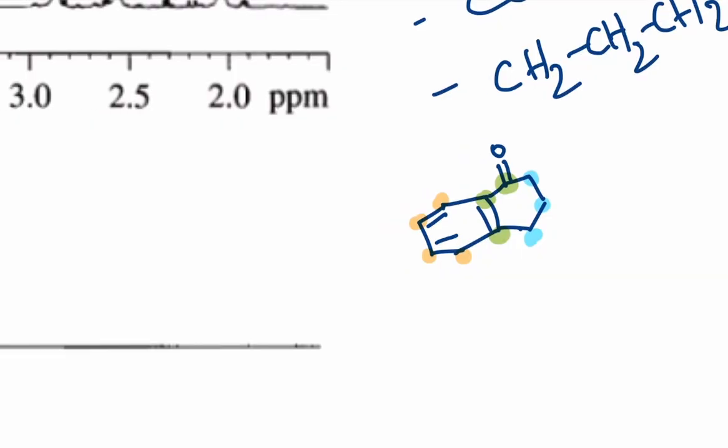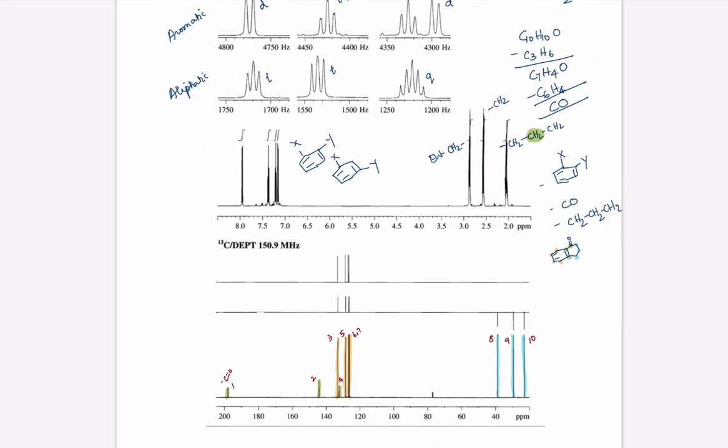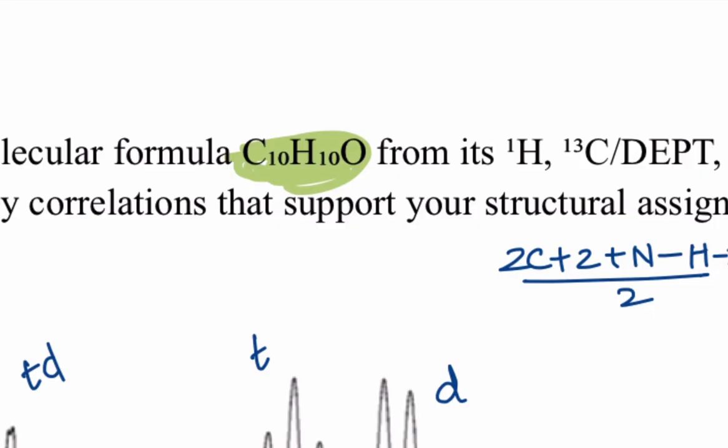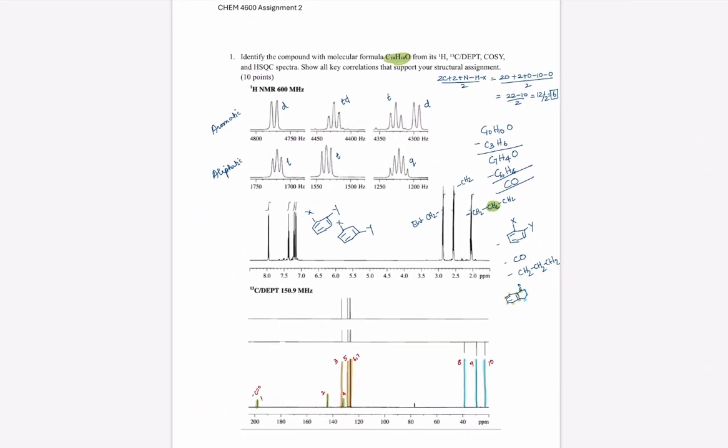Okay, now what we are going to do here is number the carbon peaks going from downfield to upfield. So 1, 2, 3, 4, 5, and there are 2 peaks here, 6, 7, 8, 9, 10. So there are totally 10 carbons, and that's exactly what we find from the molecular formula as well. Now let's take a look into the HNMR spectrum and find out the correlations between the hydrogens, and then we'll come back to the DEPT, and we'll finally go on to HSQC.